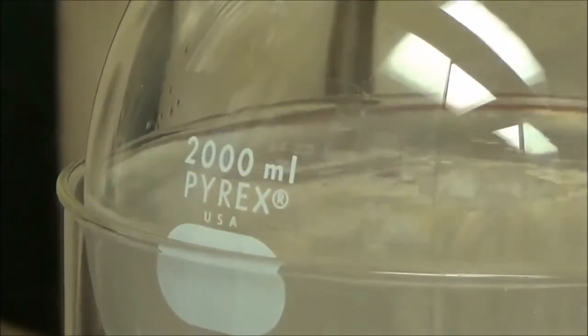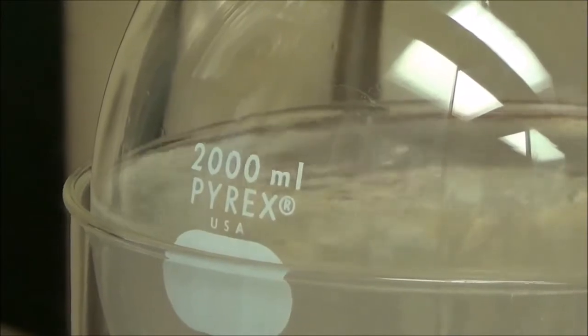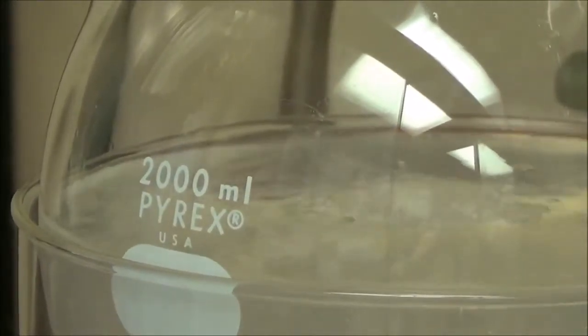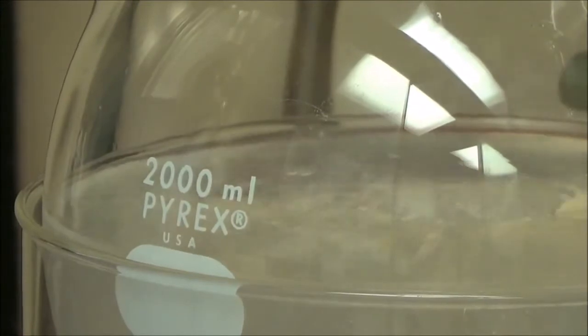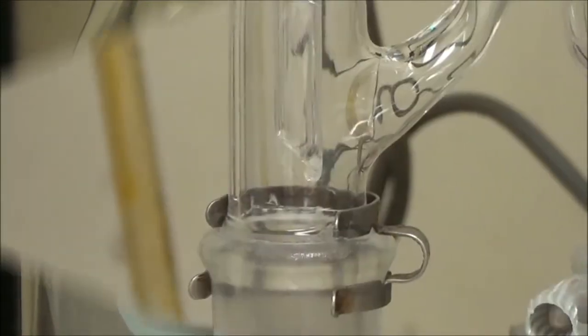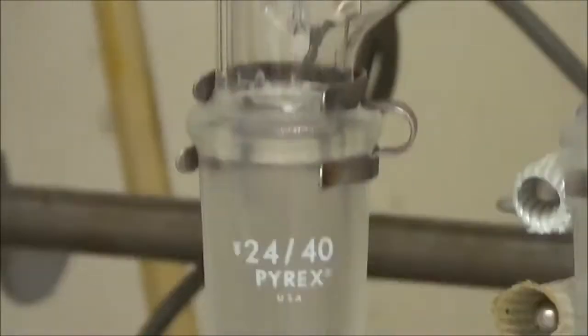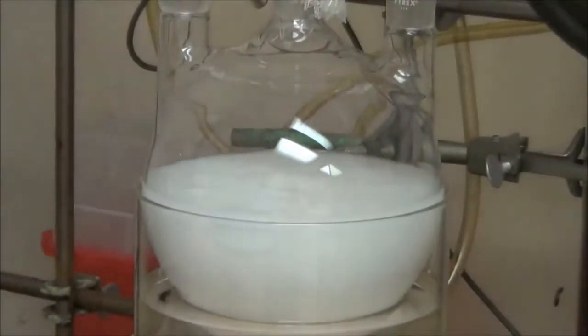You can see that the hexane is moderately refluxing. Now, it doesn't take very long before you can tell that a reaction is occurring by the formation of sodium bromide. That's the white powder that you now see in the hexane.